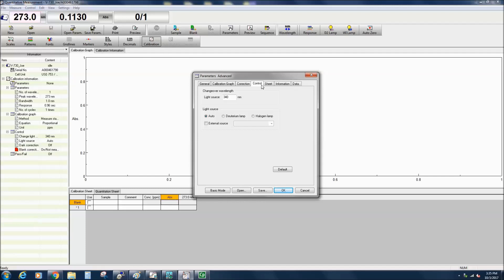You can also specify if you wish to use only the D2 or halogen lamp, or choose an external light source.